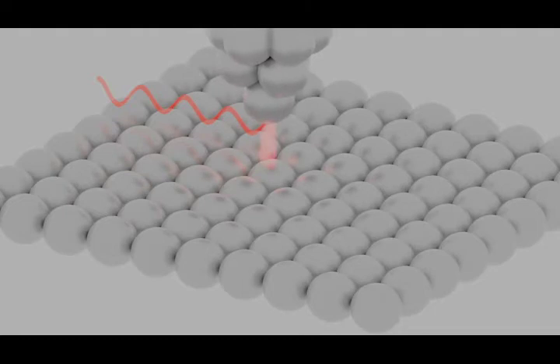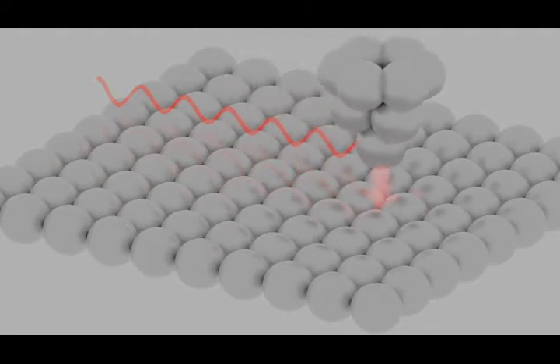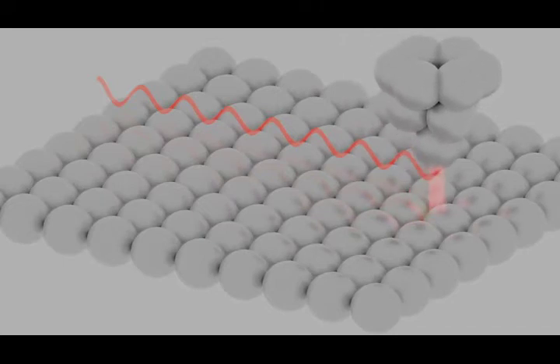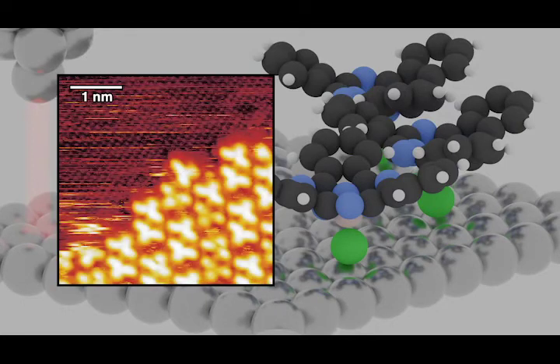Although STM images appear topographic in nature, the apparent heights are a consequence of variations in the local density of states, which according to the Tersoff-Hamann approach are a convolution of the electronic structures of the tip, surface, and any adsorbed species. As a result, it can be difficult to define the binding orientation or conformation of non-planar flexible molecules with STM alone. Additionally, conventional STM lacks chemical sensitivity.